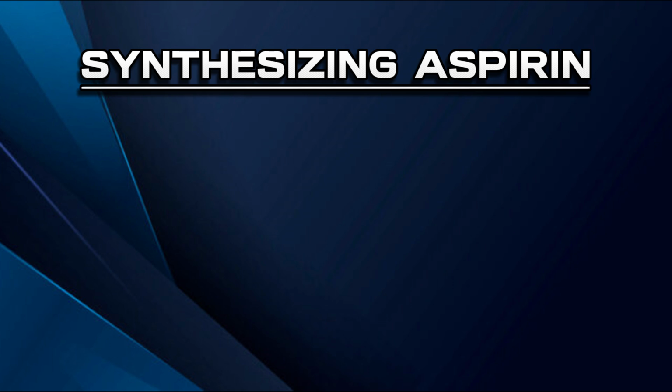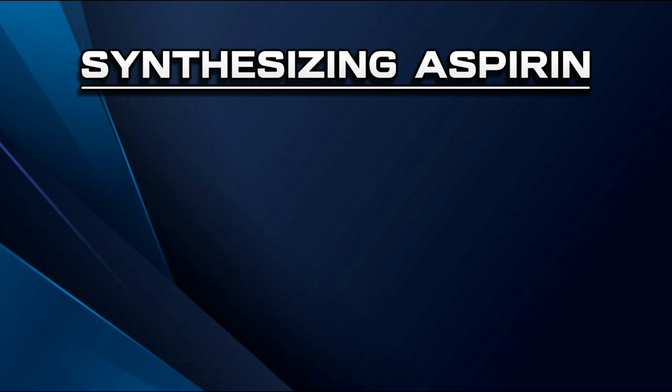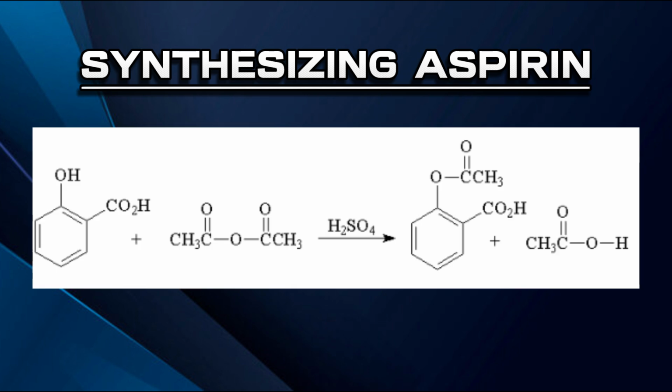In this video, I'll be using the first 7 steps of a procedure taken from LibreText to synthesize crude aspirin, which is also known as acetylsalicylic acid. This experiment procedure was created by James Chicos, David Guerin, and Valerian de Souza from the chemistry department at University of Missouri St. Louis. This synthesis involves using salicylic acid and acetic anhydride with sulfuric acid as a catalyst.